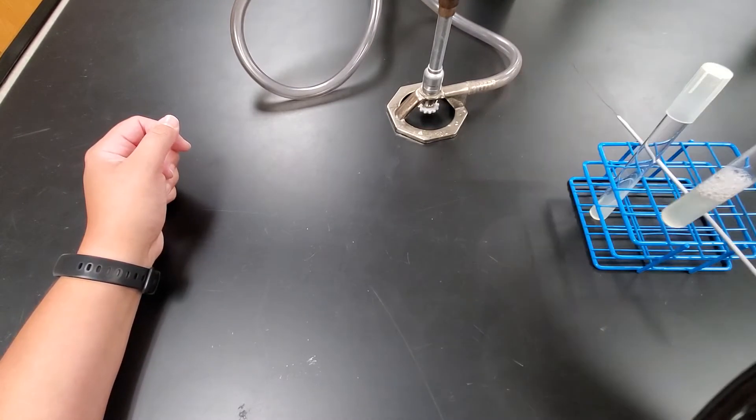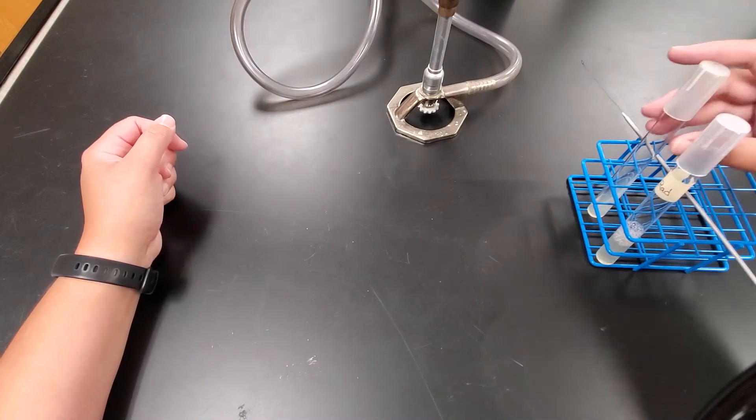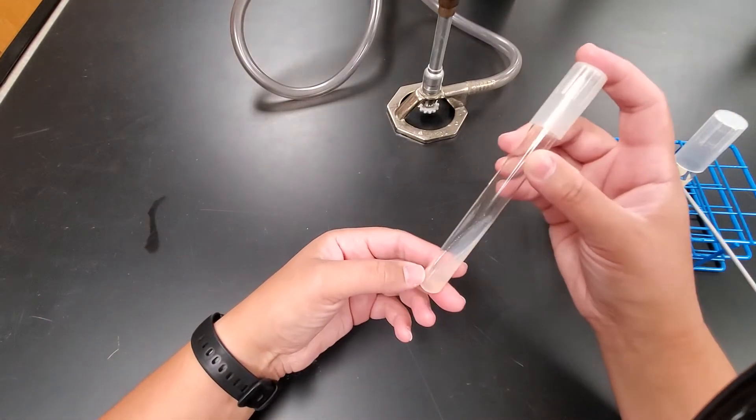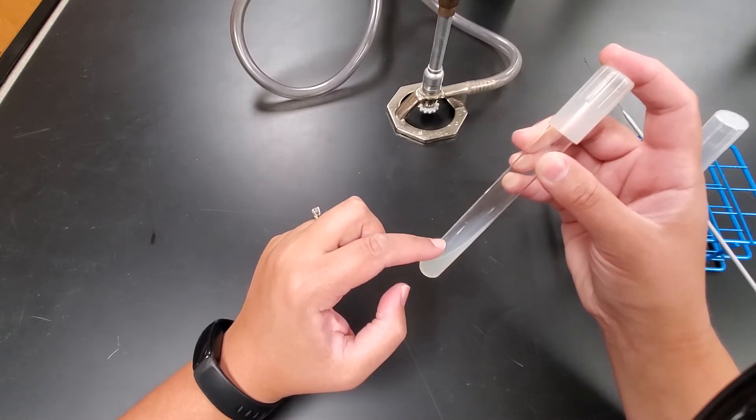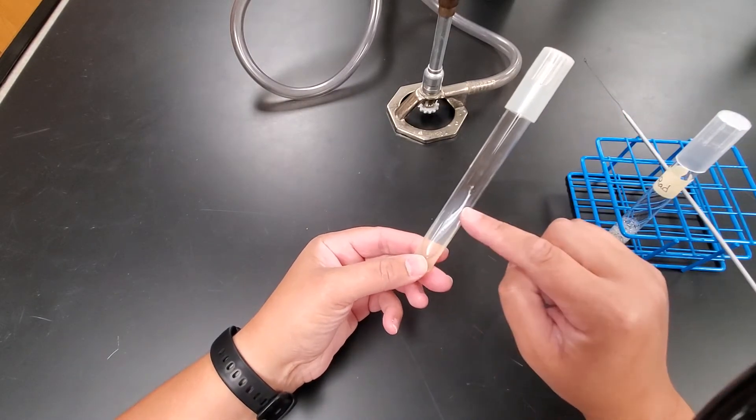So once that's suspended, we can then do an aseptic transfer. Whenever we do a transfer to an agar slant, we're going to start at the bottom and zigzag our way up with that sample up to the top.